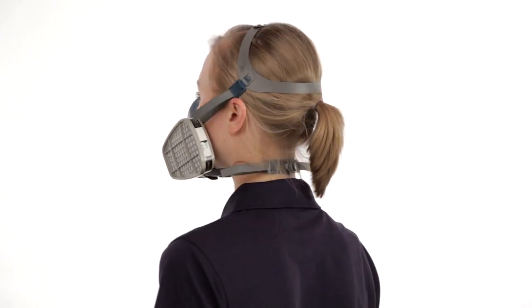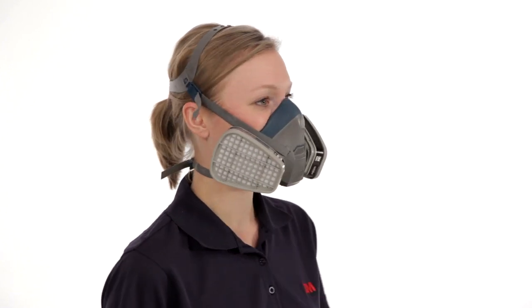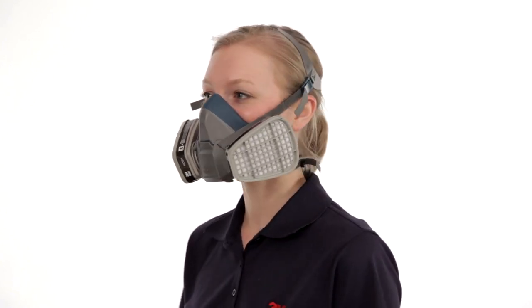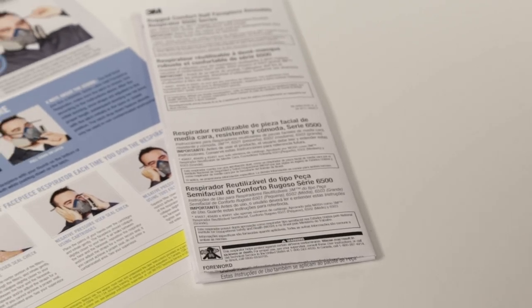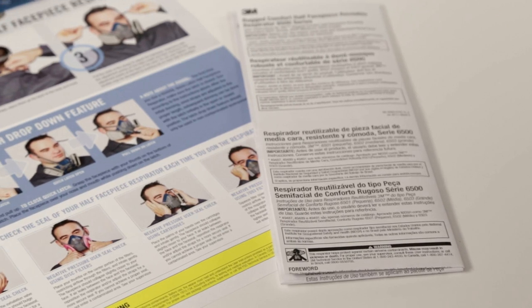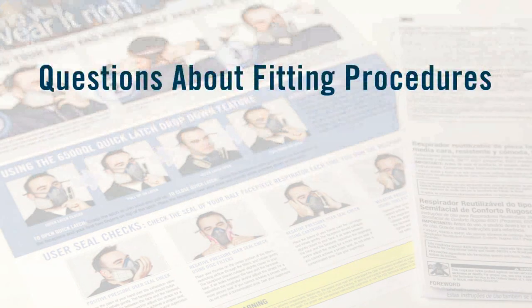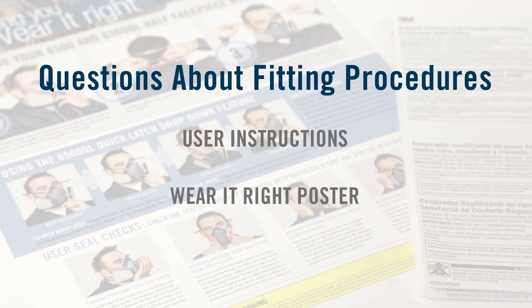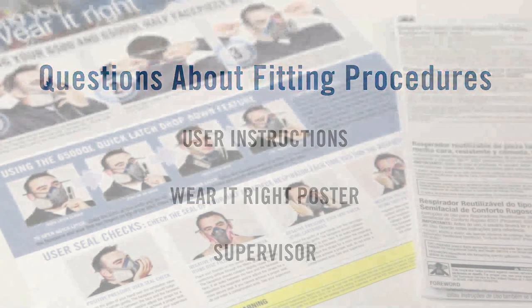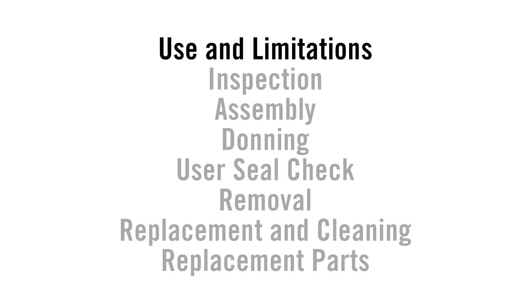Each time you wear a respirator, you must know the proper fitting procedures and follow them carefully. Today, we will introduce you to the 6500 half-facepiece respirators made by 3M and provide training on how to use and obtain optimal performance from your 3M respirator. If you still have questions about correct fitting procedures after viewing the appropriate segment, review the user instructions, check the steps on the poster provided by 3M, or see your supervisor.